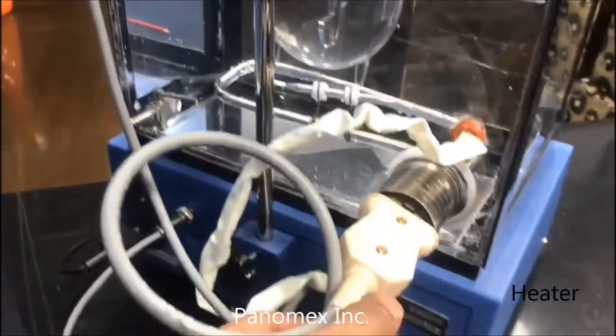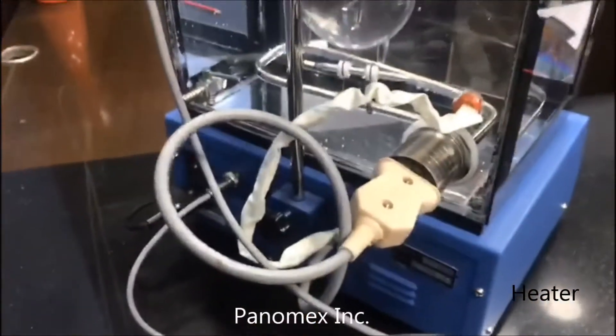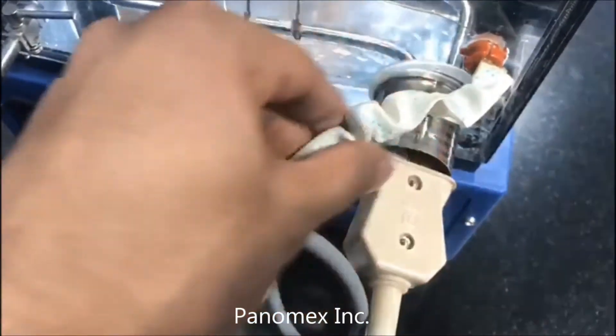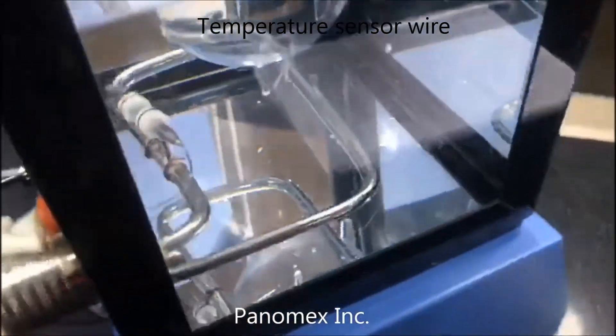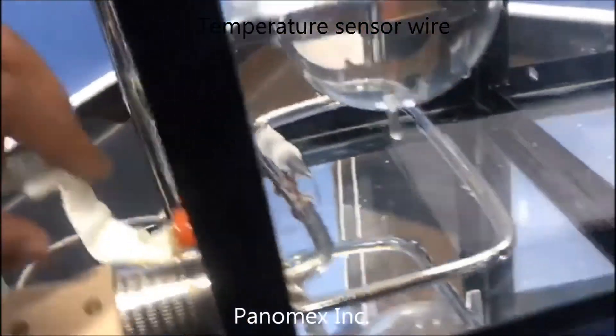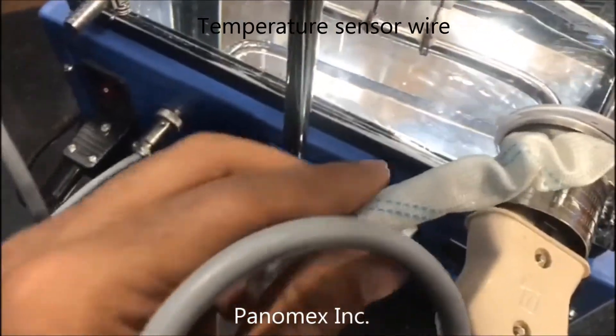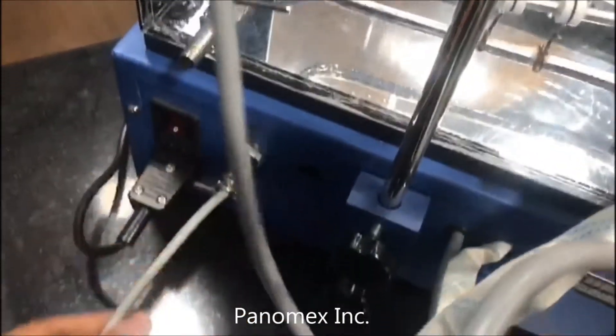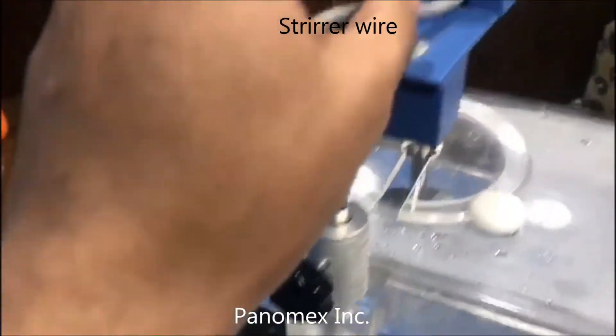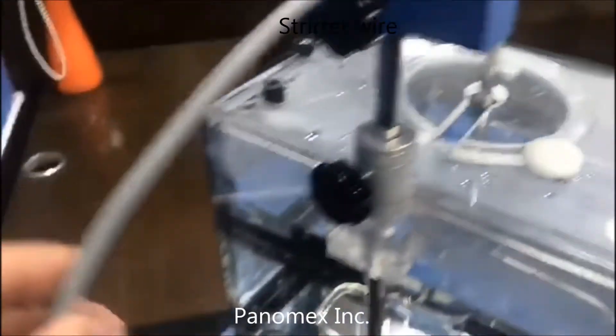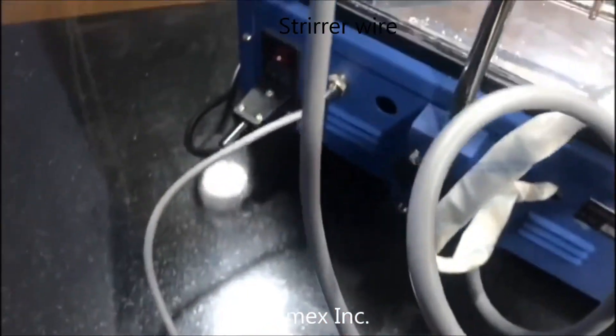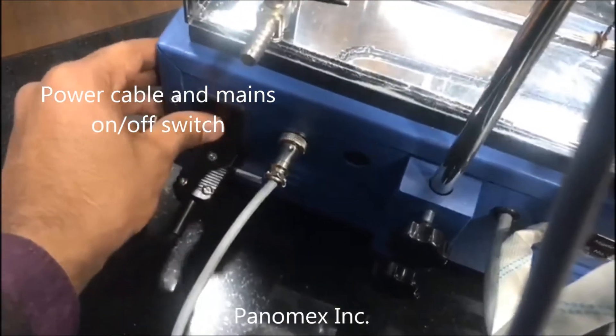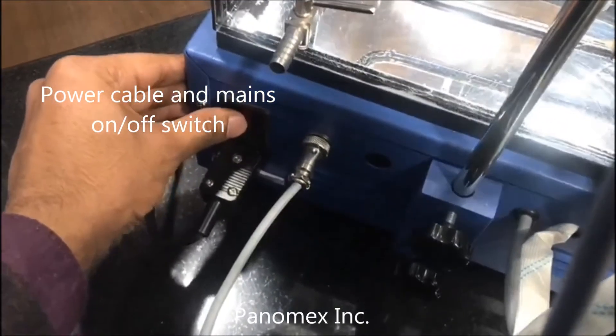This is for the heating. This is the temperature sensor. As you can see, it is going inside and showing here, so the temperature sensor is connected. This is for the stirring. This is for the power, and this is the mains on and off.